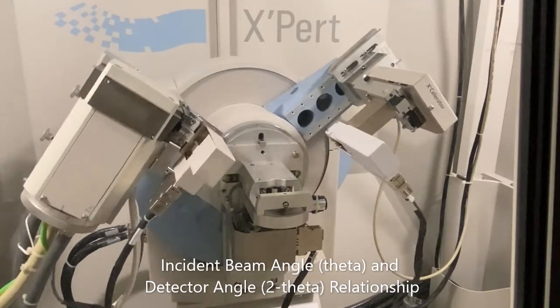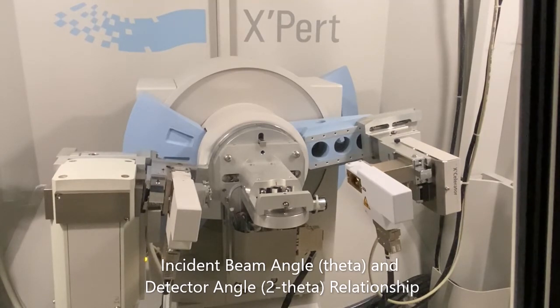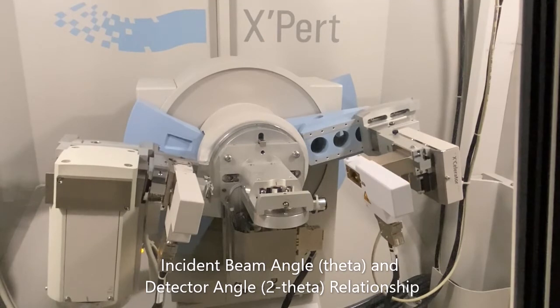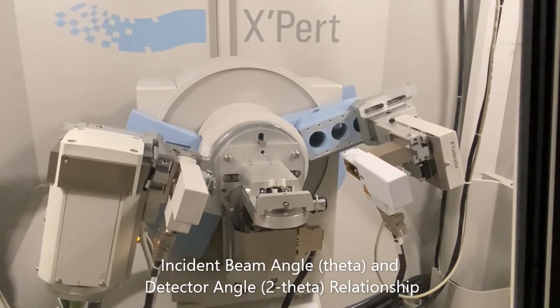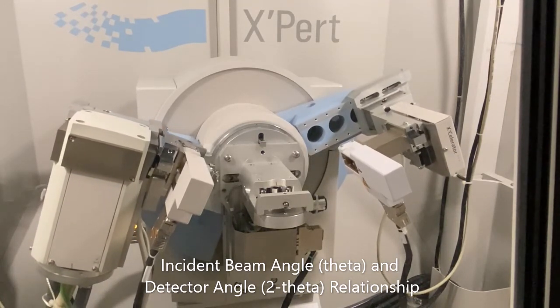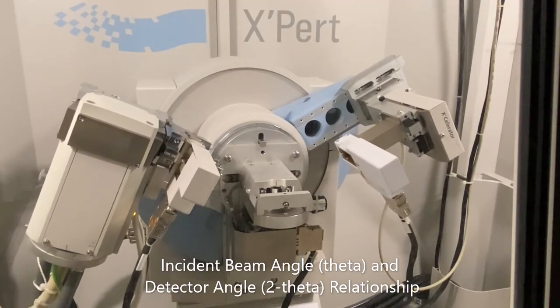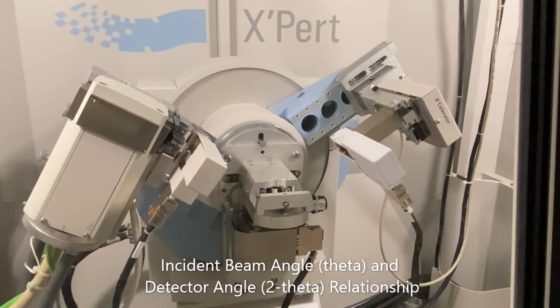At the start of data collection, both the X-ray source and the X-ray detector will move down to close to horizontal position. This is where theta is a relatively small angle to start, in this case 10 degrees, and the detector is located at the equivalent 10 degrees above horizontal in the opposite direction, which we define as being 2 theta or 20 degrees.